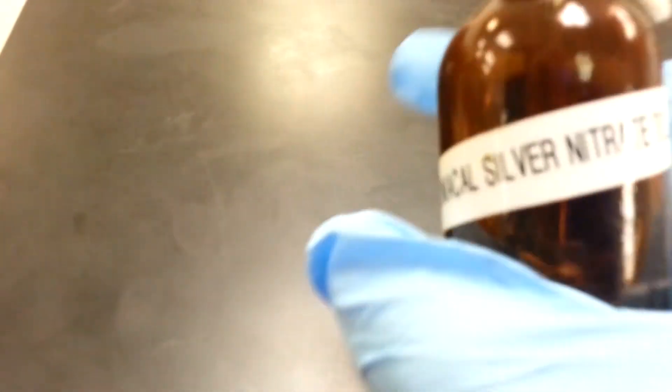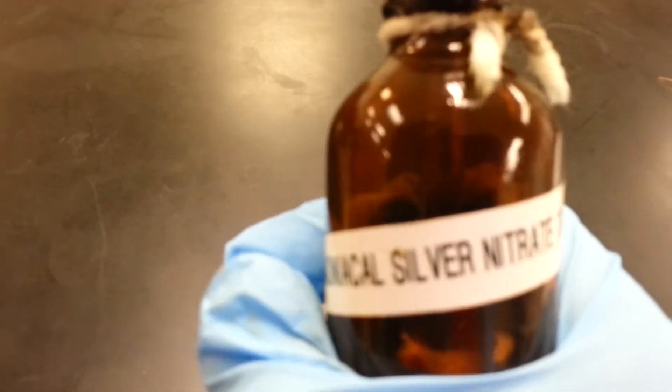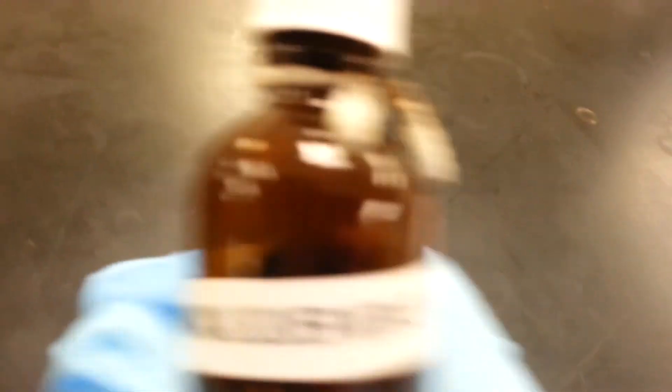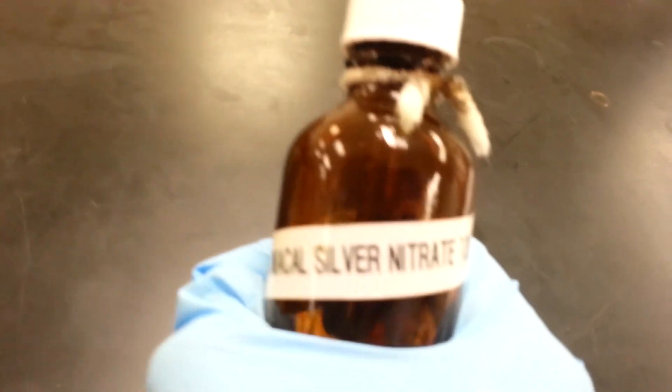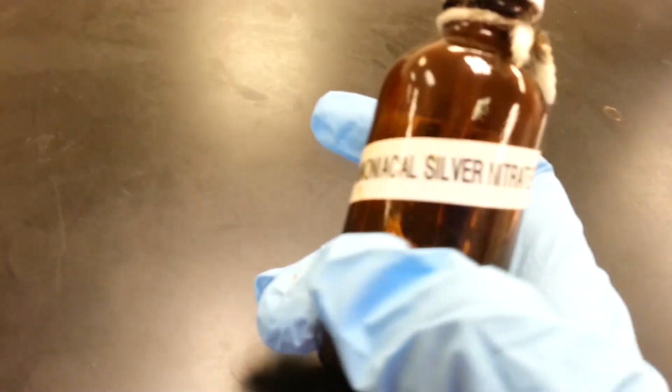The thing is, you need to know about Tollens, you do not, of course you should never pour chemicals down the drain anyways, but this one you definitely do not, because it forms silver fulminate or something. If you pour it down the drain, you could cause an explosion. In fact, you can't even store this for a long time. That's why we make small amounts, so they use all of it.